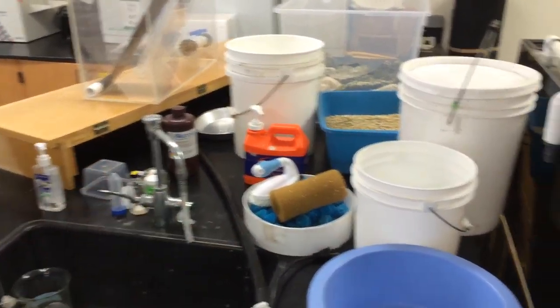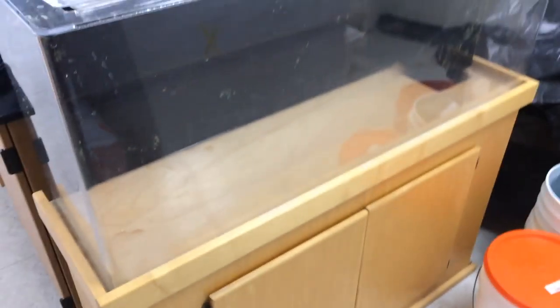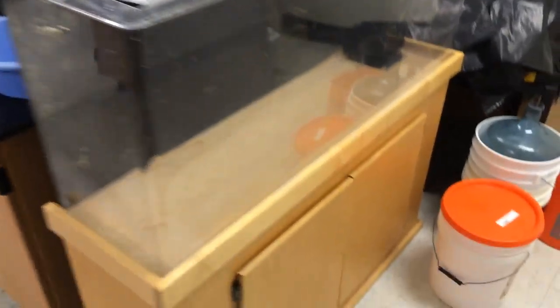Things are not assembled because stuff is still drying, so I didn't want to fully reassemble everything. But basically, you guys can move this where you want. So 55-gallon tank, the sump will go down in here.